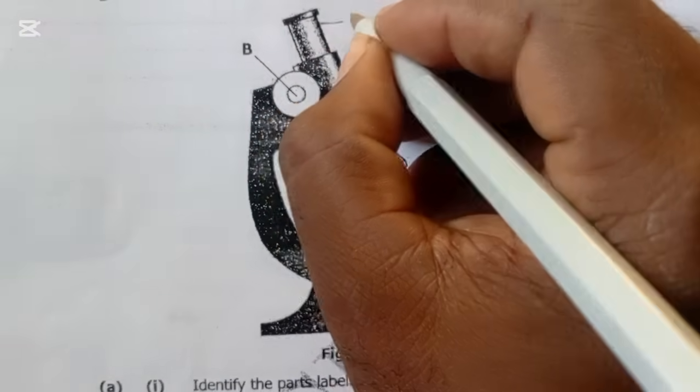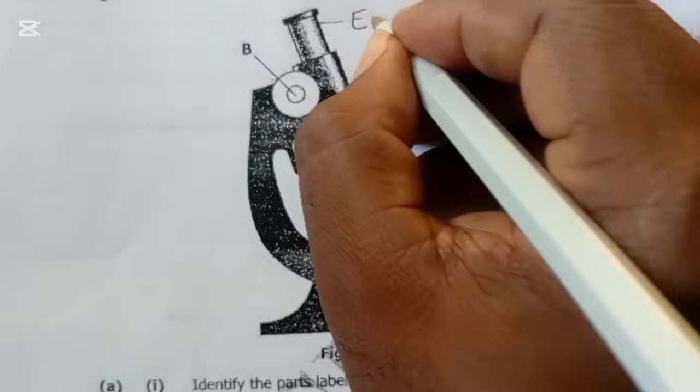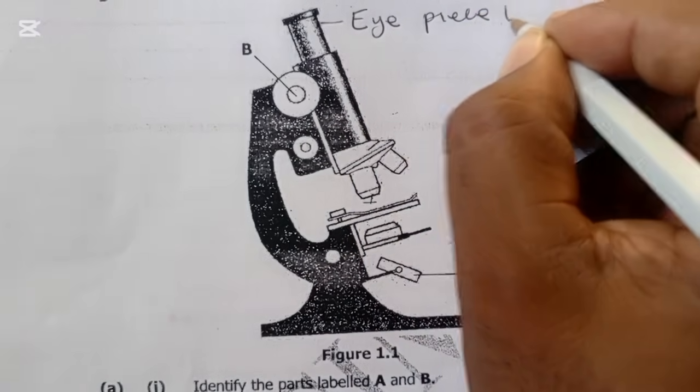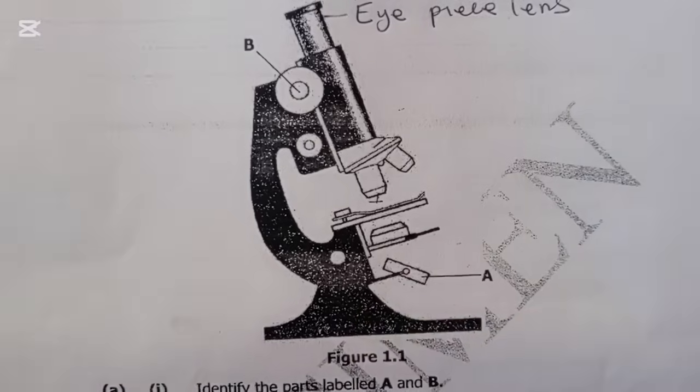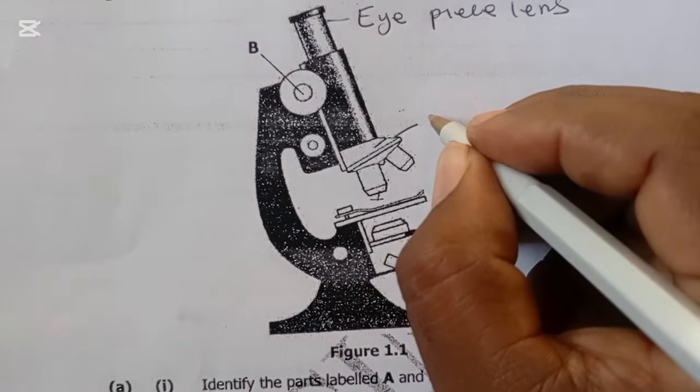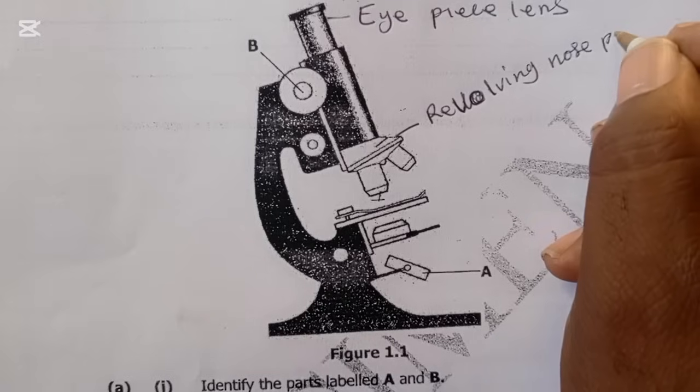So we have this is the eyepiece lens. And this is the revolving nose piece.